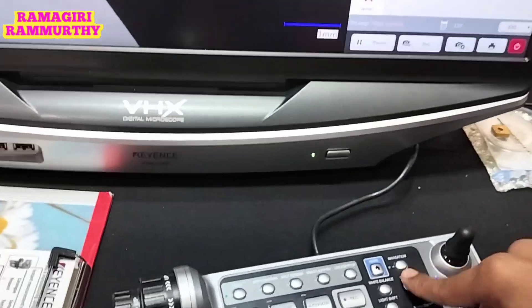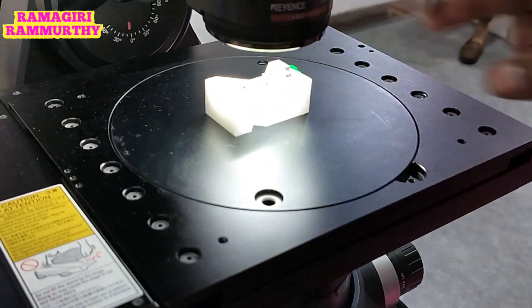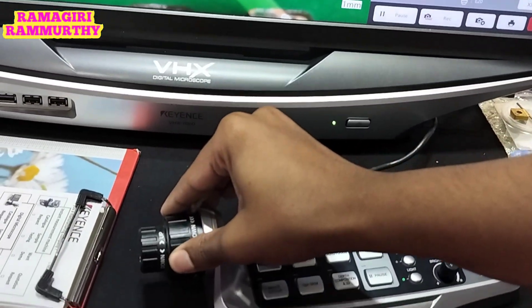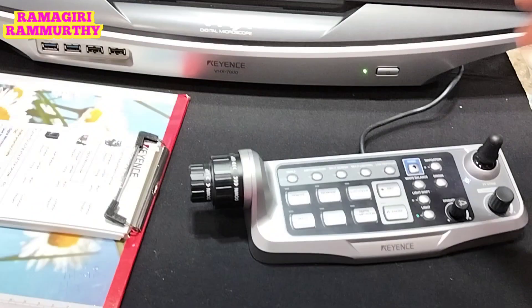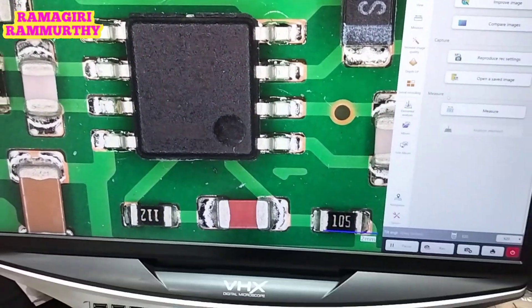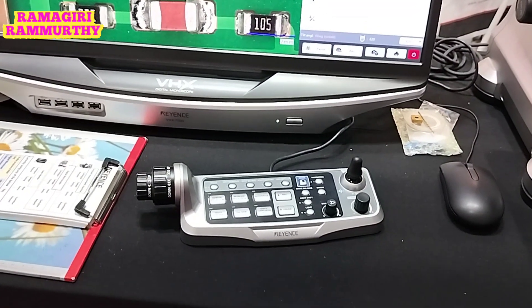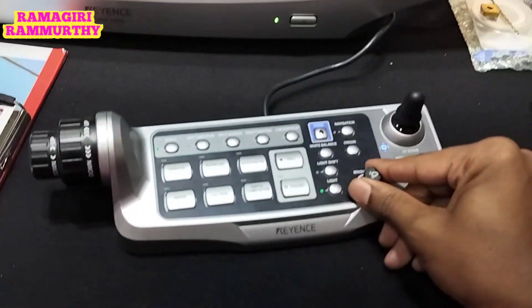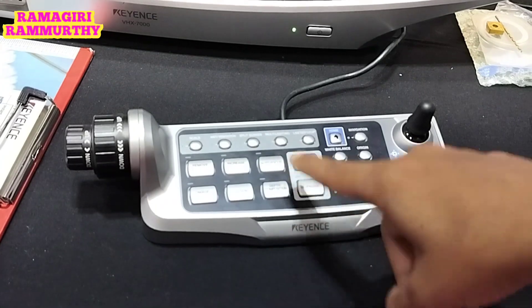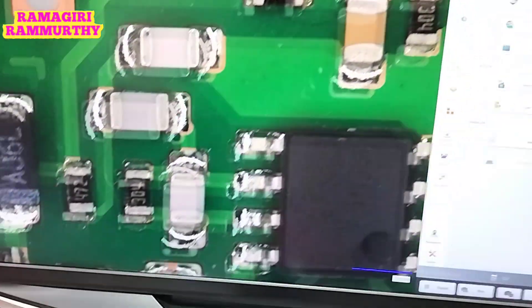Now let's go for one live representation. You can see this is one PCB that I have placed here — a live PCB. Here you can see a good representation of our system. Magnification starts from 20x to 6000x in this device. We also have different variants starting from 0.1x. I can navigate across the PCB using this console, navigating freely on the screen and covering different aspects.